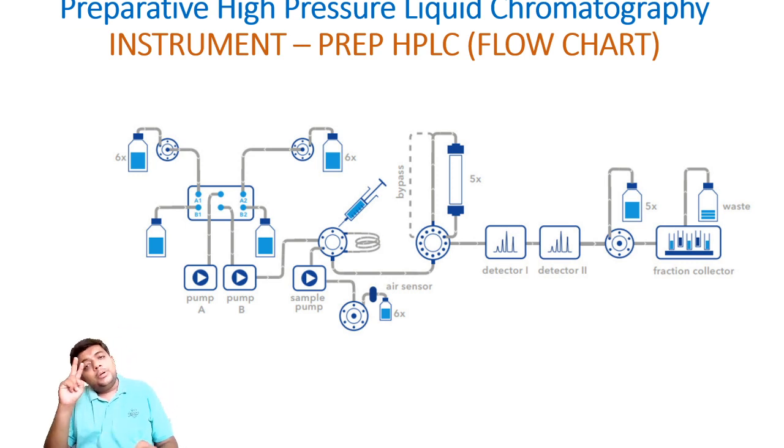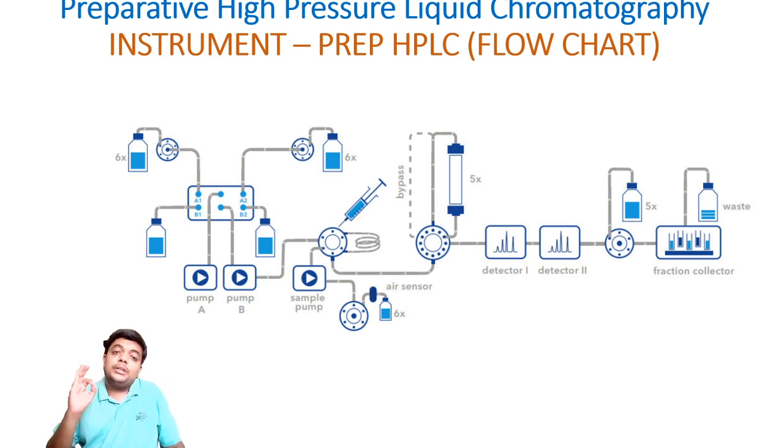The only two important aspects that are to be covered over here involve: number one, an excessive sample pump component can be used, because the sample over here is not 1 or 2 milligram or microgram, it might be up to an ml or 2 ml, and when the sample quantity is larger, 10 ml, 15 ml, 20 ml, sometimes you require a thrust to be given.